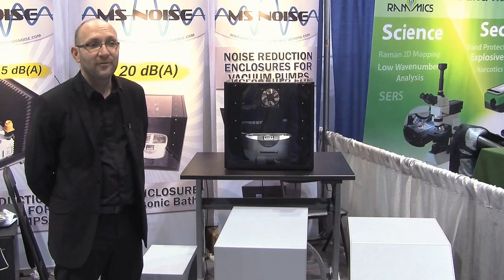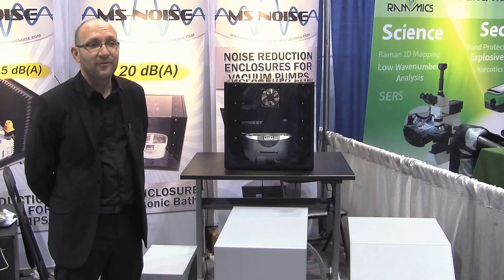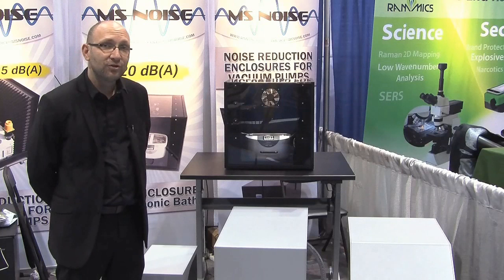We discovered many laboratories have noise issues because of vacuum pumps, nitrogen generators, water chillers. A lot of systems in the lab generate a lot of noise, and we try to find solutions to decrease the noise in the lab.